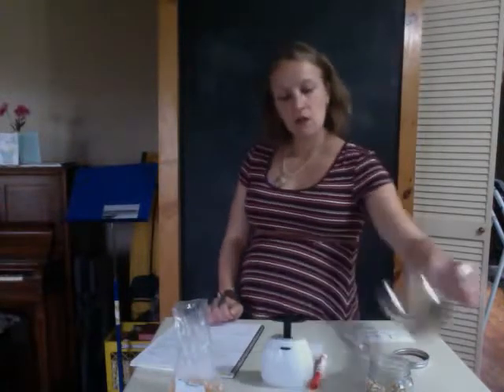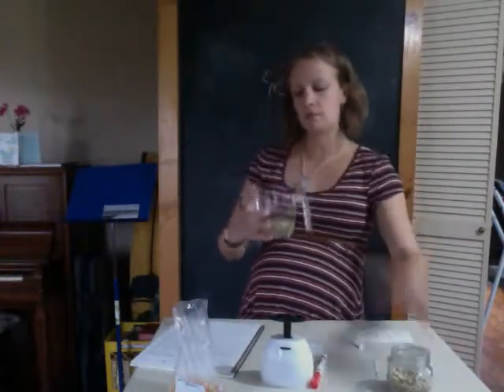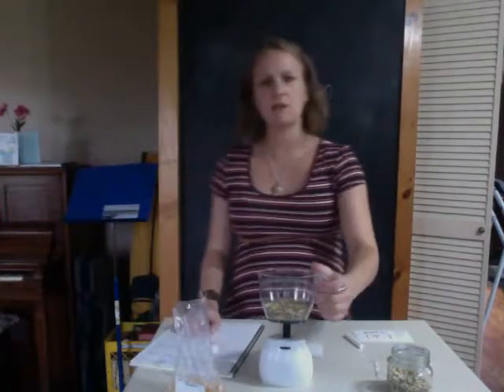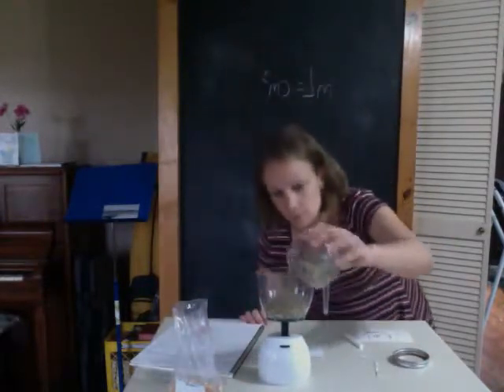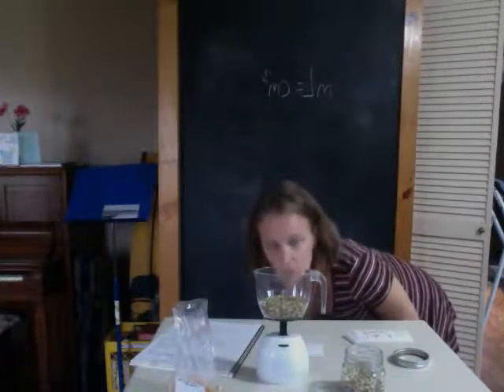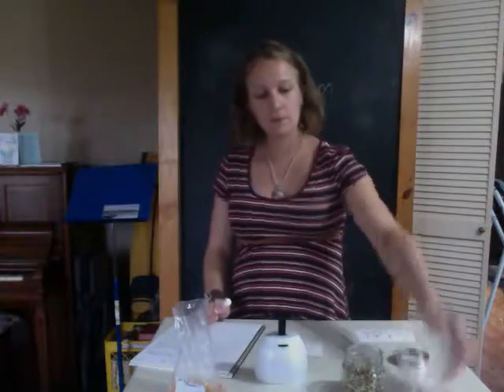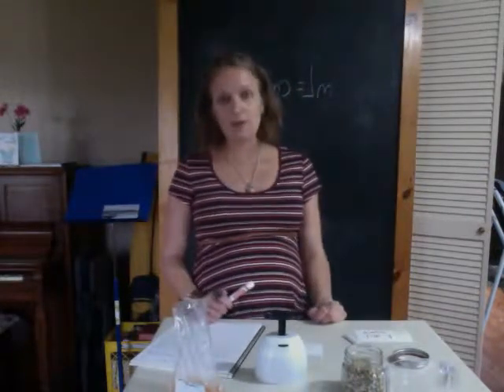Okay, so on to sample measurement 2 for the mung beans. And it looks like we have about 60 grams. Are these two samples looking very different from each other? To me, not so much. So we're getting closer to our answer about whether or not these two types of lentils weigh significantly different amounts. So now I get 40 grams again. Okay. Now with my data, I'm going to calculate the averages and the average deviations to determine if these two samples are different.